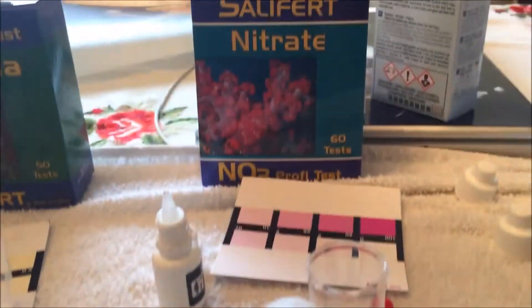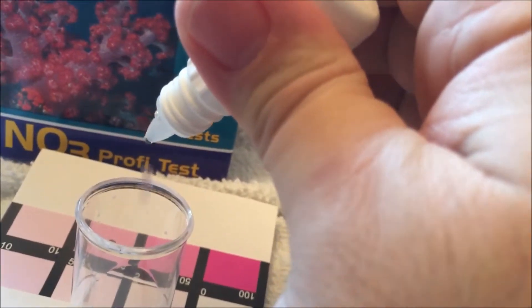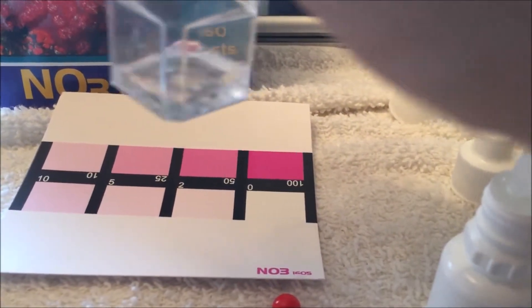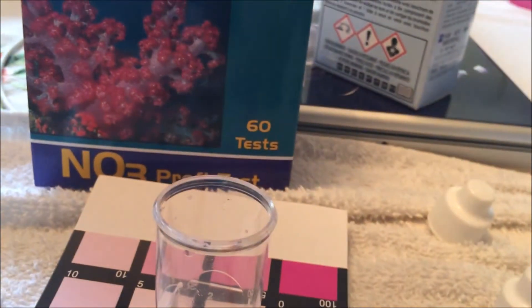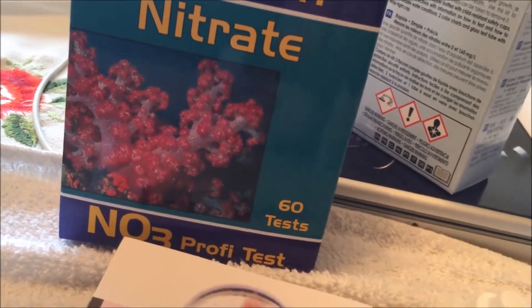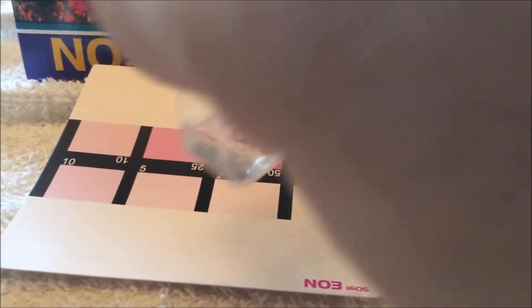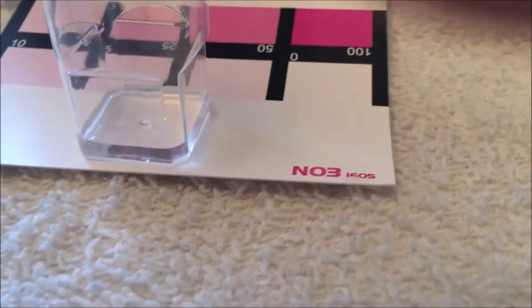Next we're going to do the Salifert nitrate test. We already have the water in here - you can see it's clear. We add four drops - one, two, three, four - and shake it around for a few seconds. Then we're going to add a capful of number two and shake that for a few seconds until it mixes in.